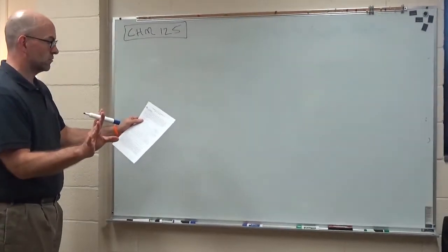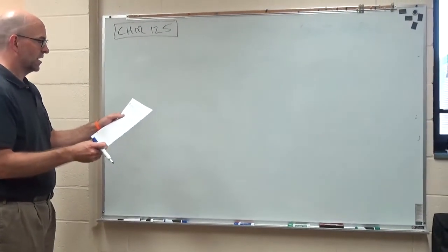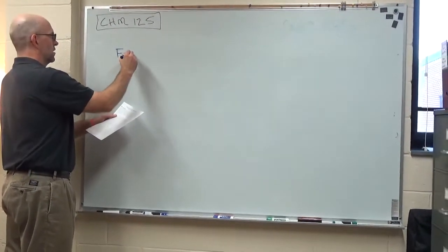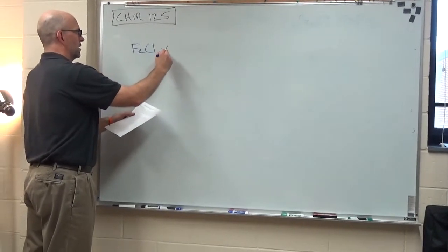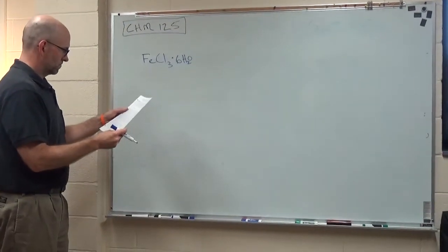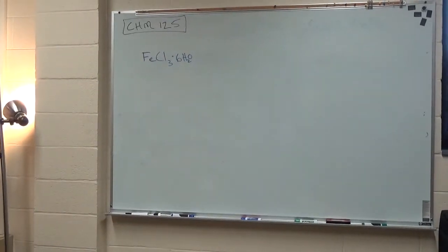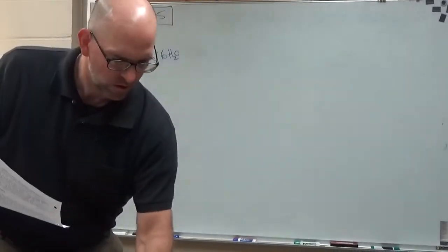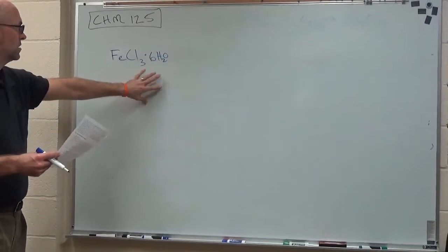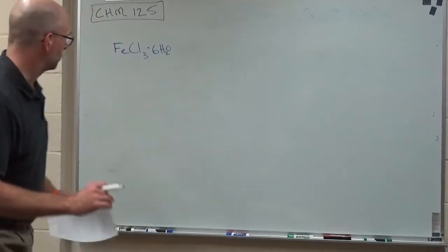So here I'm just rewriting what's in the introduction to the synthesis of iron(III) acetylacetonate. And we're not worried about necessarily how these chemicals are structured. So you're taking iron(III) chloride hexahydrate. Well, it says aq here, but if you read the procedure, so I'm looking at the procedure, the way you're actually using it, I'm not even going to bother with putting the subscripts for now, is 270 milligrams.